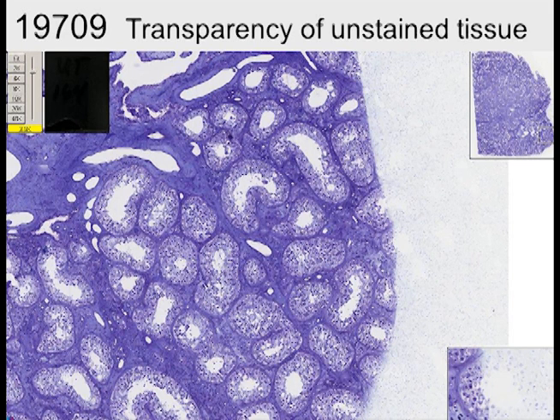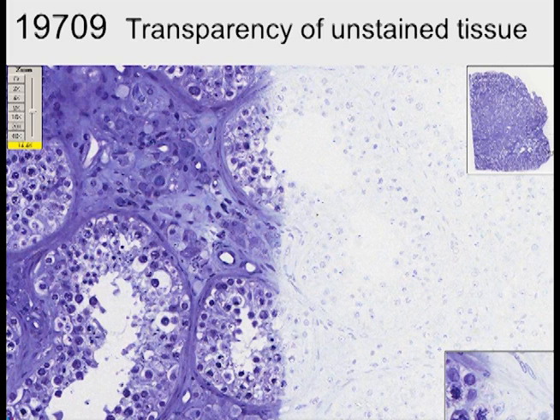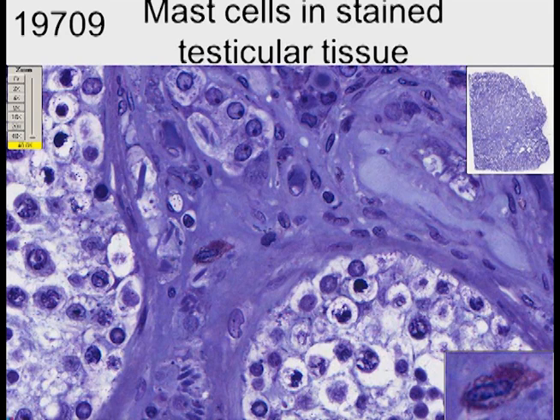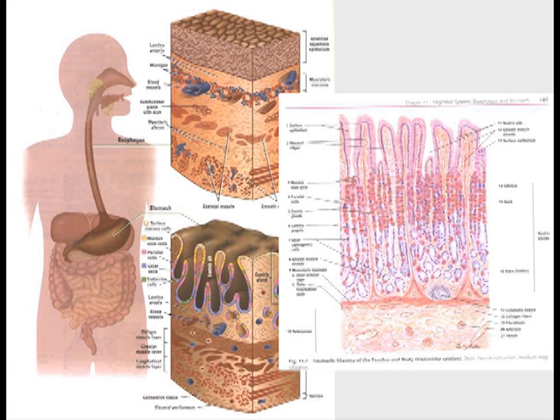Now slide 19709 shows you that tissue is largely transparent until it's stained. Here you can see where the stain did not stain all the tissue, and you can see through the area where there was no stain. You have to literally stain the tissue to be able to see it — it's a differential stain, so you can see the surrounding tissue around the cells pretty well, but you cannot see it on the right side that has not been stained. Sometimes when you look at unstained tissue, you can see some cells that are stained — here we can see some mast cells or granules. With staining, you can see the granules even better. So we have tubules on the outside, interstitium in between, and mast cells in the interstitium.